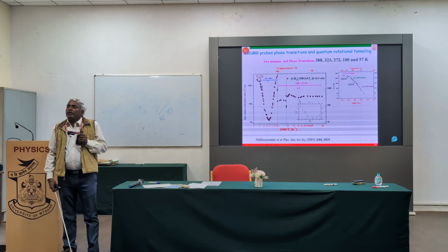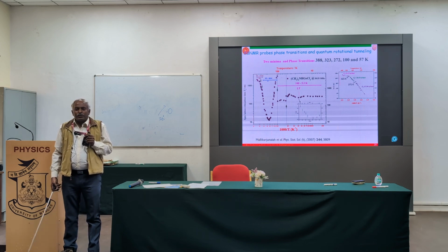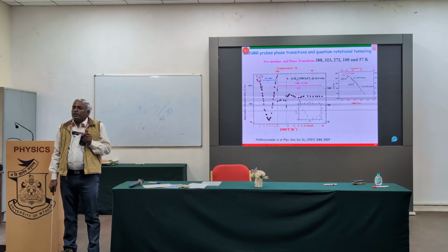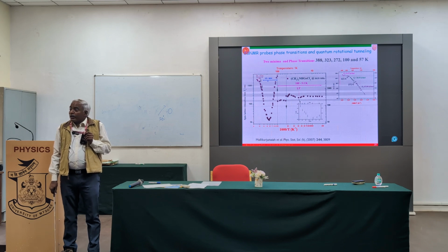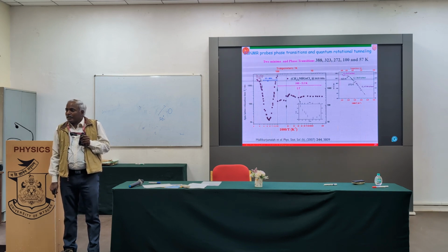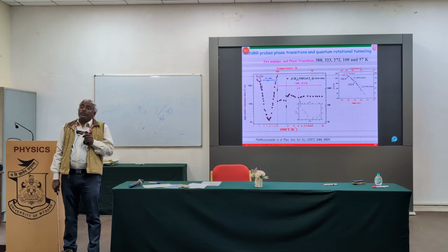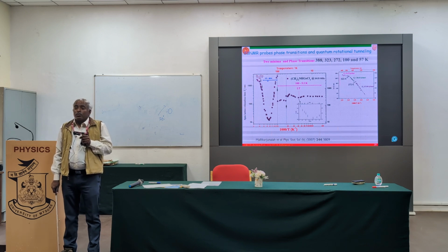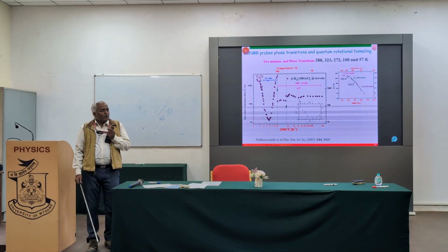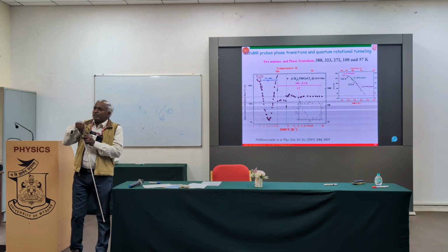Okay. This was done with our home built NMR spectrometer. We had the coolant system. We had the liquid. All of you know that, right? What is the boiling point of liquid nitrogen? 77 Kelvin. Okay. That is equivalent to minus 195 degrees centigrade. What is the boiling point of liquid helium? 4.2 Kelvin exactly.